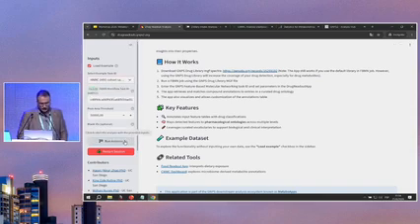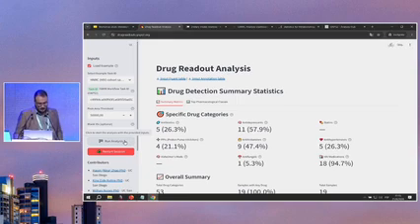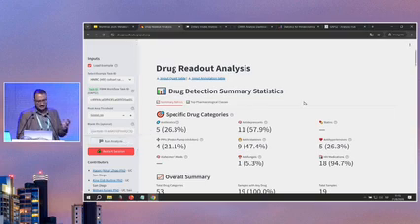Okay, that's a good question. I'm not sure if everyone listened. So basically, I'm sorry, what's her name? Laxon? Okay. Latson basically asked me how exactly the workflow works to compare your data to the drug library. If I'm correct, that's basically it, and how the curation for that has been done. So it's the curation of the MSMS spectral database. It's a little bit different for some of those tools.